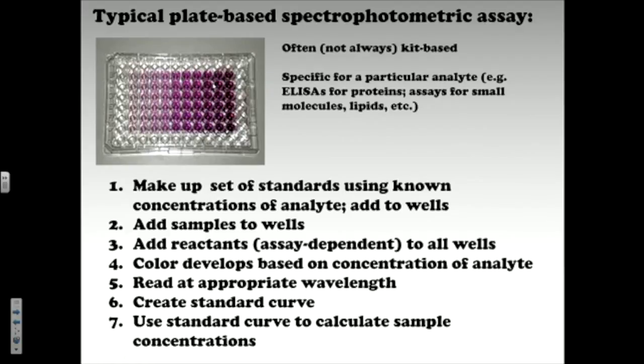Yeah, there's only part of it you'll need this for. It's just your predictions about what the concentrations will be. Or you can just use it up here if there's not going to be enough to go around. Yeah, for the beginning part, it's going to be predicting based on what it looks like, what you think the concentrations are going to be. But then the reading of it is on the back, and so you don't need to be able to see it to do that. You could, sure.